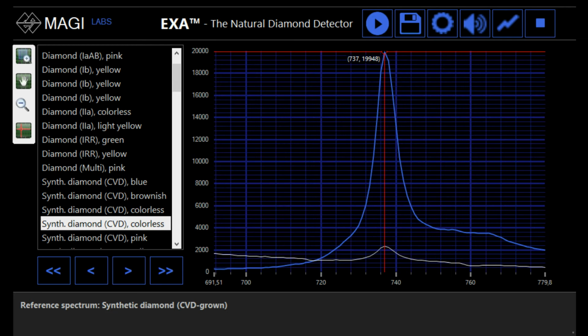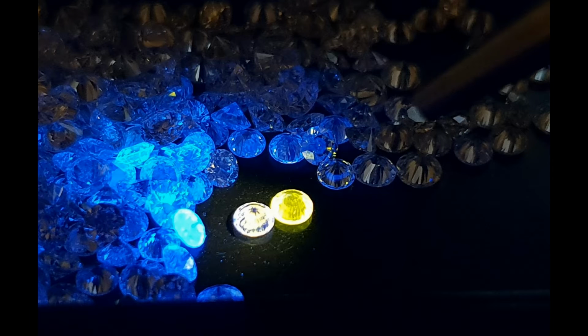Unfortunately, synthetic HPHT do not show specific consistent features, so a combination of other techniques is required for their correct identification. Sometimes diamonds exhibiting a distinct yellow, yellowish-green or greenish-yellow fluorescence can be referred. They are not uncommon, especially in the melee size. The main reason for the refer is the strong reaction often caused by H3 and or S2, S3 defects, which often overwhelms the capacity of the spectrometer to detect the N3 if it's present.